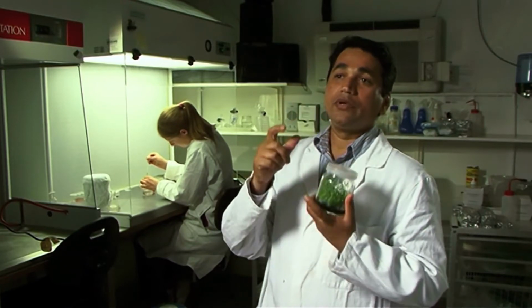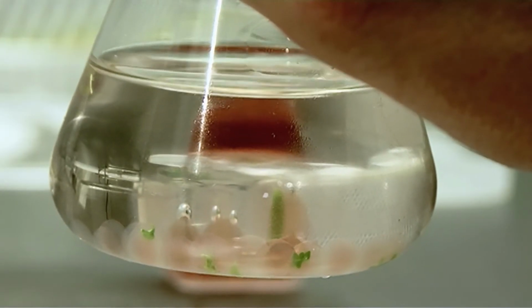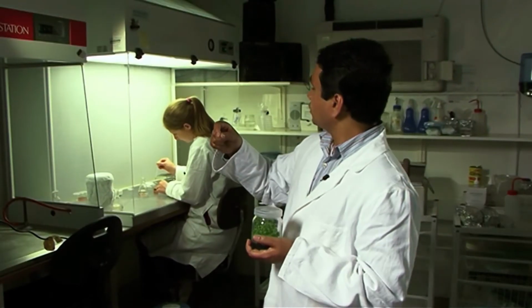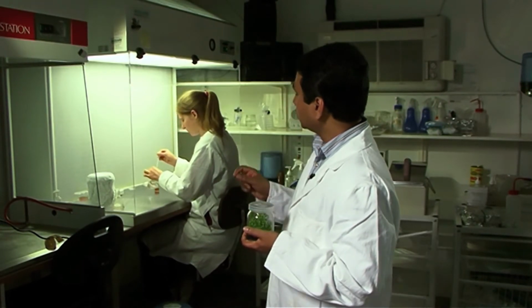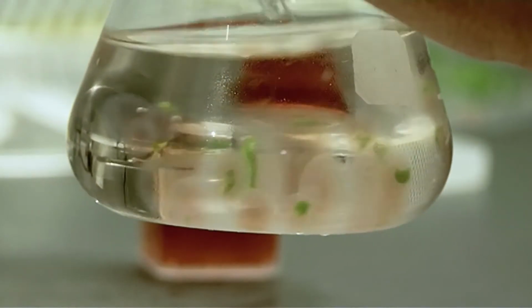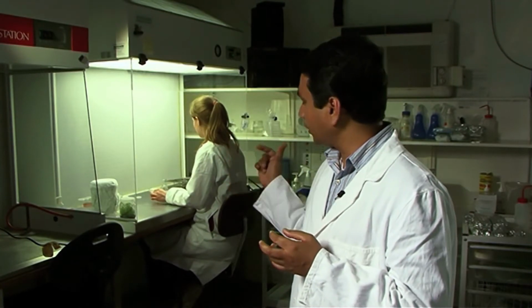What we do is we mix two chemicals. One is called sodium alginate and the other calcium chloride. When we drop the sodium alginate into calcium chloride, as Poppy is doing now, you make a bead trapping that plant material inside. And once you've done that, you can put that plant material in liquid nitrogen, and you can store that forever. So that is called cryopreservation.